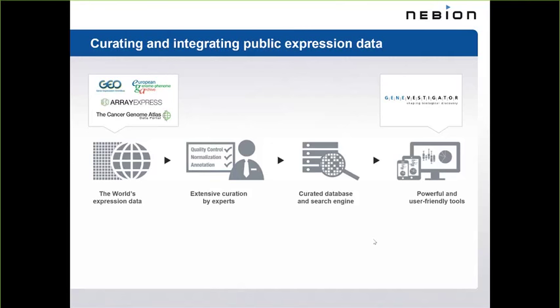We've explored a data set in Qlucore Omics Explorer, and we've identified a signature of genes that are related or regulated upon infliximab treatment. And this is in responsive patients of Crohn's disease in colon samples specifically. However, whether this is really specific for Crohn's disease, we don't know because we've only looked at this one study.